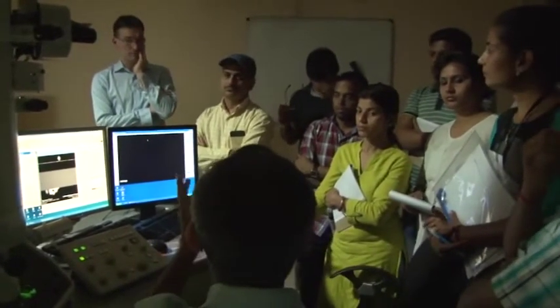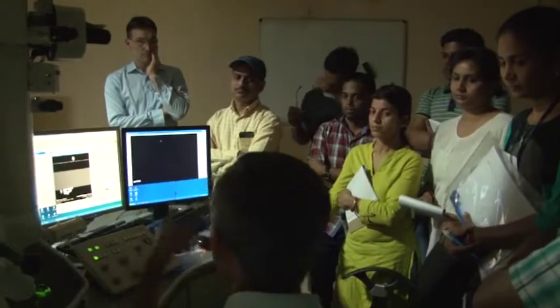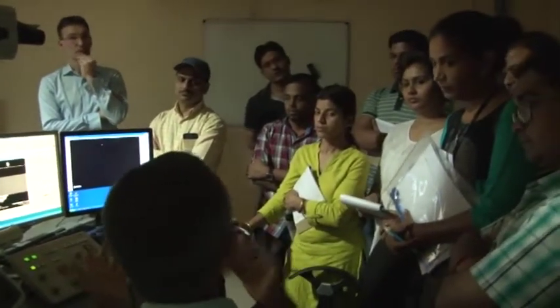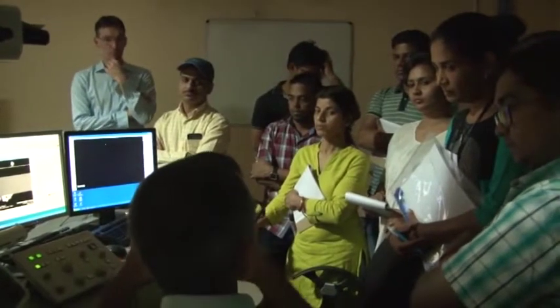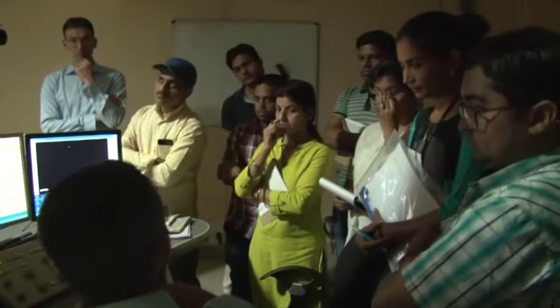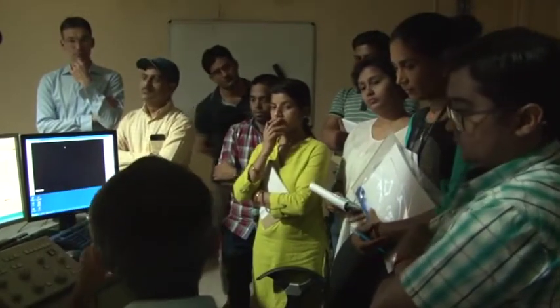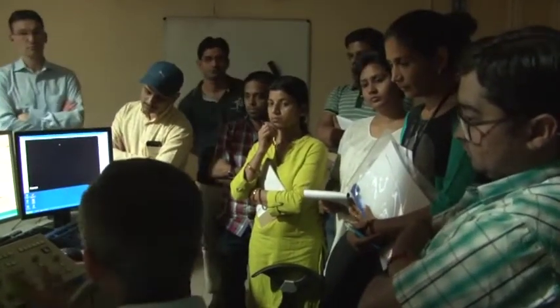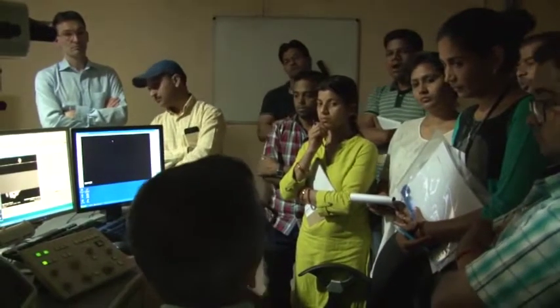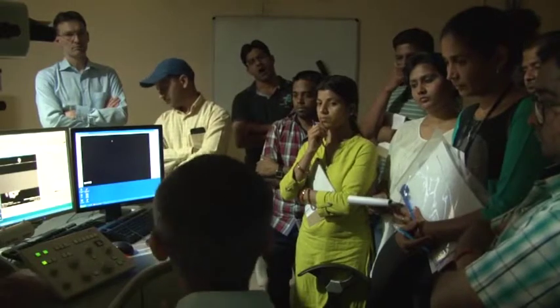I don't know exactly by how much, but they change it. When the voltage is changing, the power of the objective lens changes, or effectively the focus changes, or effectively the magnification changes. And if the objective lens is exactly sitting on the optic axis, then only its magnification should change, but the image should not shift on the screen.